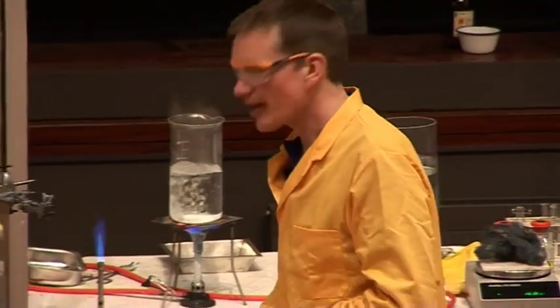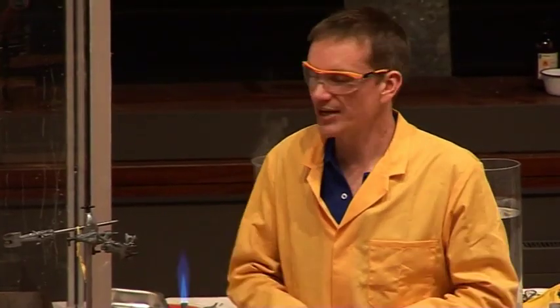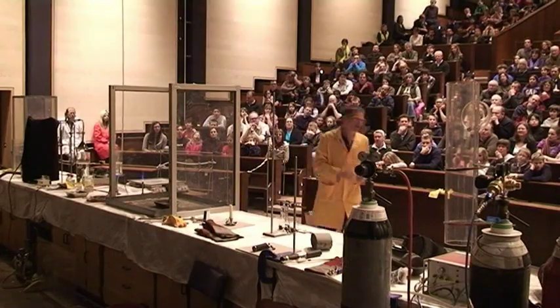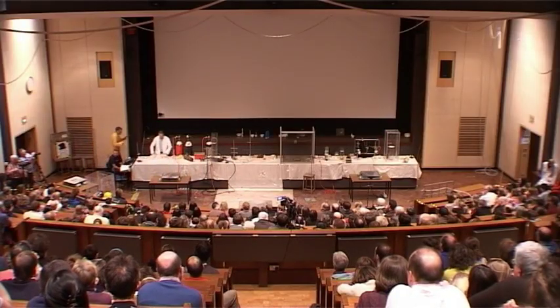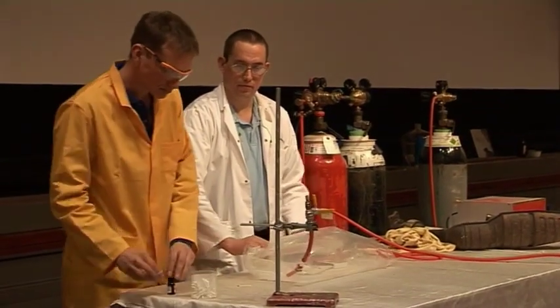Now, so far, in all of the reactions that we've looked at, there have all been various things combining with the oxygen gas and giving out energy. But in each case, we've needed to supply some energy to start the reaction. We've needed to either use a match or a candle, a flame, to start the reaction. Now, do we always need to supply some energy to start the reaction? Well, let's go back to our hydrogen. Remember the hydrogen in the bag? We showed that it was hydrogen. We squeezed some out of the bag here and lit it with a match.